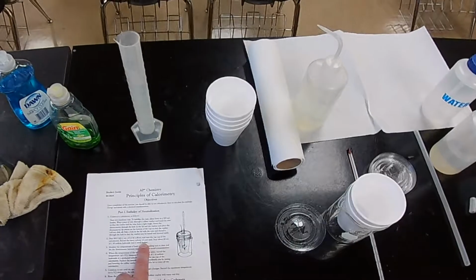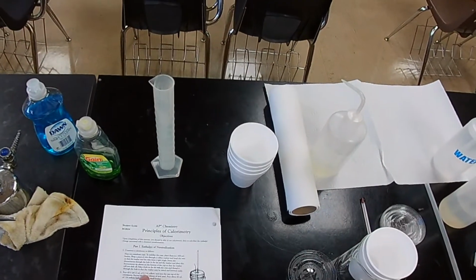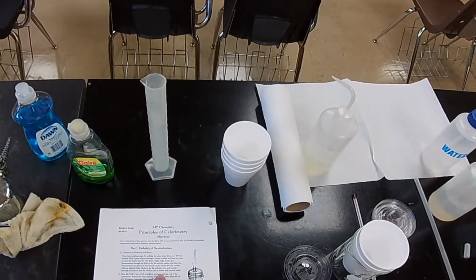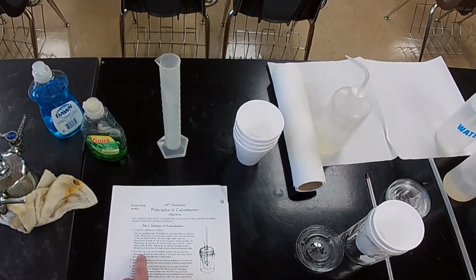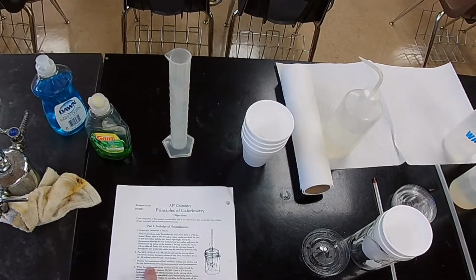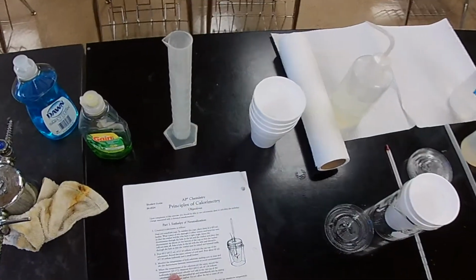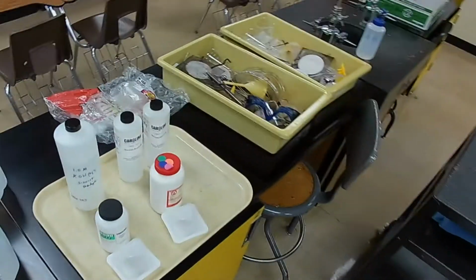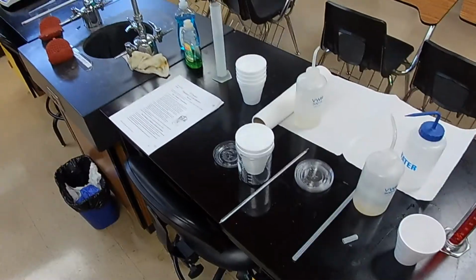We're going to use 60 milliliters of 0.5 molar sulfuric acid and put that in the calorimeter, 60 milliliters. Then we're going to measure out 50 milliliters of sodium hydroxide, 1 molar sodium hydroxide. Okay? So, here's our sulfuric acid, and I better glove up for this.